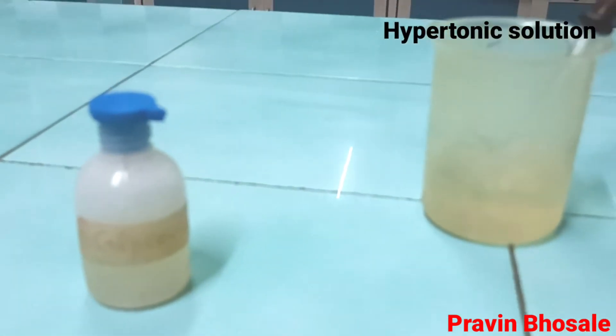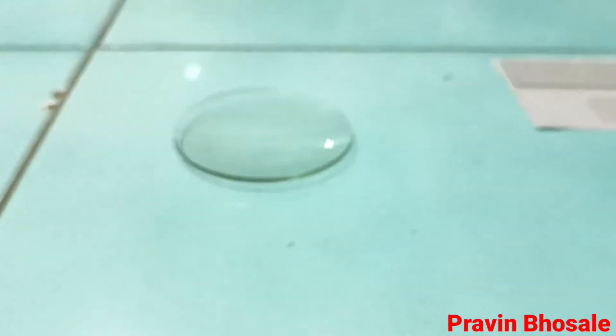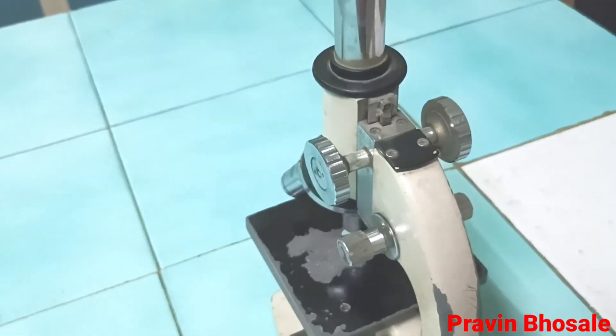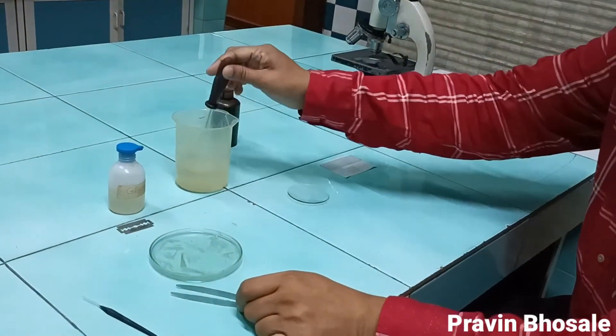Then we require hypertonic solution — I have taken sugar solution — then watch glass, slide, and coverslip. And very importantly, the microscope. So let's start with the practical.